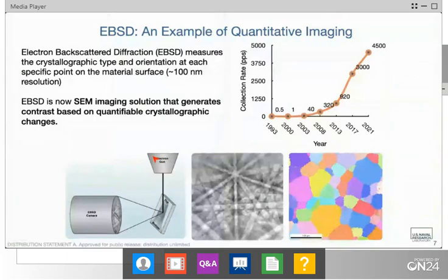And so now we have an imaging method that is extremely easy to segment. I have a quantitative measure. I can say I want to have a misorientation gradient no more than this amount, say 3 degrees, right? And that's going to label any kind of grain boundary within there. Any points that are within that threshold all become labeled as one single grain. And we know that that is directly tied to properties that we see as being important. So that's why EBSD is so critically important.